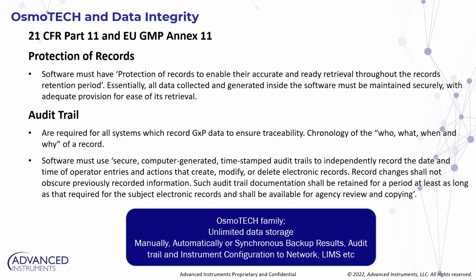So you can do this very often. Automatic backup can be done as frequently as once a day. Synchronous can be done as frequently as every 5 minutes. So you really will have the latest version of the data set stored and backed up in your network.